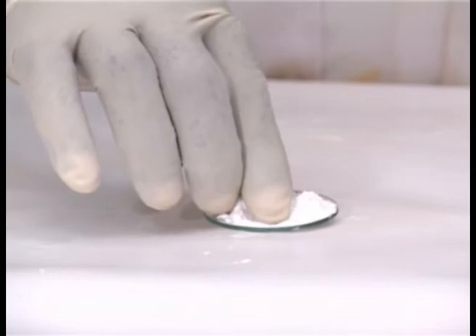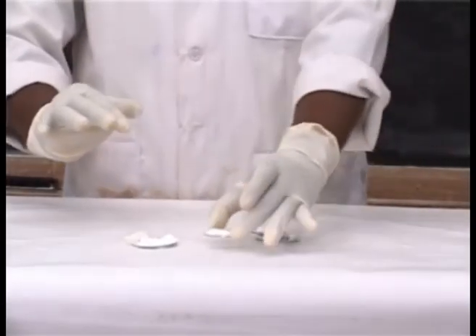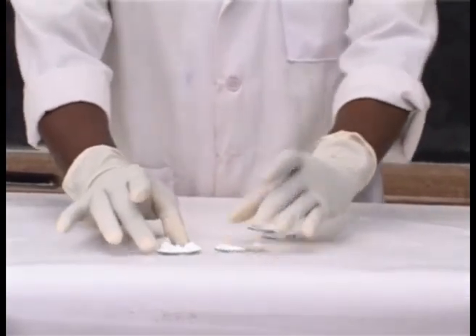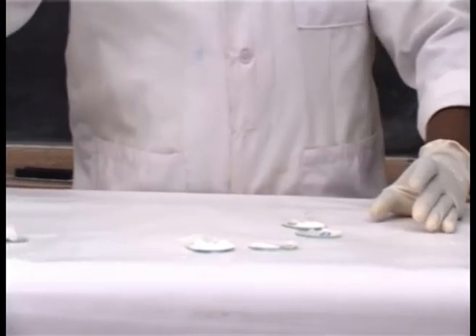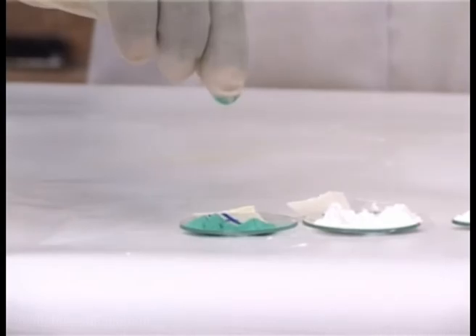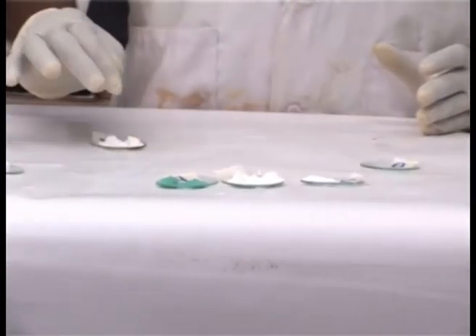Salt A is in powder form. Salt C is also in powder form. Salt H is in powder form. Salt D is fine crystals.